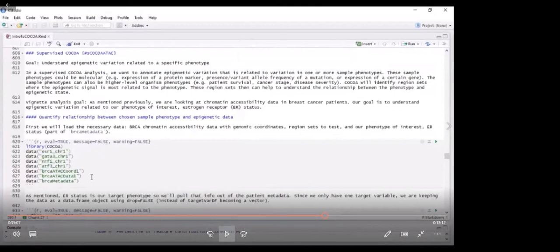Basically we have the average correlation of a given region with the principal component, and then based on the distribution of the correlations for all the CpGs, we can convert that to a percentile. But that calculation is separate for each principal component.